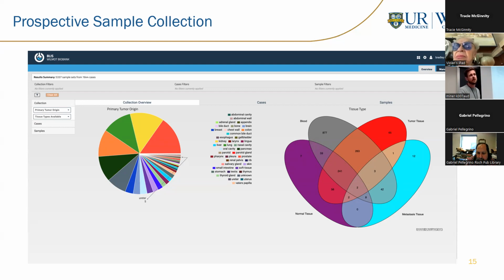Yeah, I think that's really best too, and as I mentioned, tailoring what type of processing is done based on the tumor type and the research being done in that community here. I think that's really important, especially for xenografts. In that scenario, I think it would be best if maybe not the whole department, but those prostate researchers who are interested in doing xenograft get together and we come up with a protocol for those collections. Because there are several ways to do xenografting, and what would be best for us, and I think the community in general, is if we approach a discussion and develop a standardized protocol for everybody to use. And maybe that's different from prostate xenograft to breast xenograft or whatnot. But I think starting that discussion with the greater research group is really the best way to go about it.